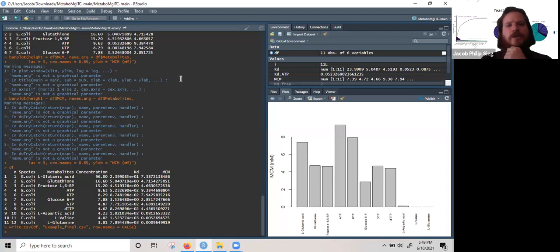So today I will be showing you how to use my custom ITC data analysis functions included in my MetaboMgITC package. If you haven't already done so, please watch the help video tutorial that shows you how to set up the program on my GitHub page.